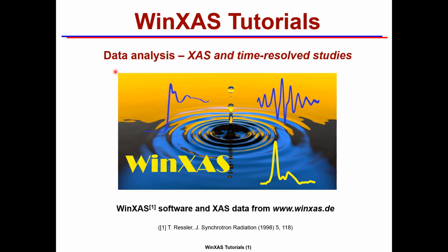Hello and welcome to WinXAS Tutorials, where eventually I want to talk about analysis of XAS data from time-resolved studies. A lot of the topics and procedures we talked about in previous tutorials will come together here to analyze a series of XAS spectra. As always, the WinXAS software and the XAS data I will be using in the hands-on session can be obtained from the WinXAS website.